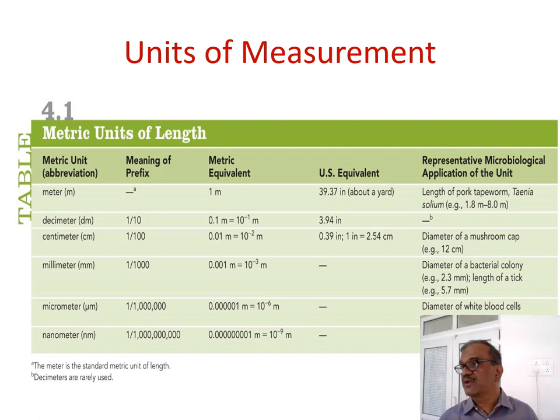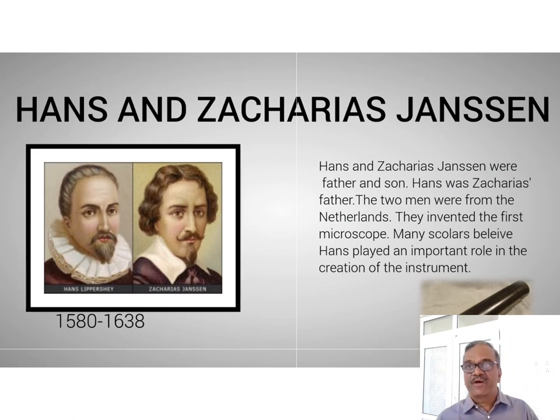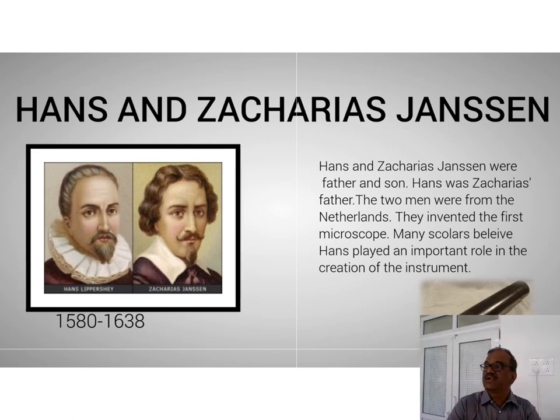You have to observe under a microscope and then see that. Observe under the electron microscope and see the virus particles, how many nanometers they are measuring. Okay, so that comes under the nanometer. Okay, so the first microscope was invented by a father and a son.